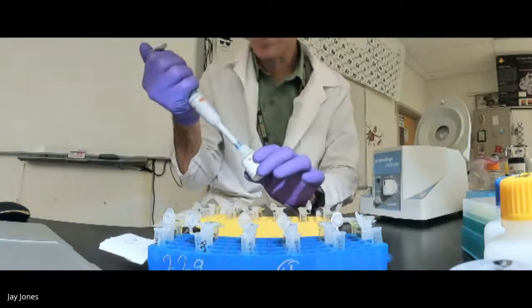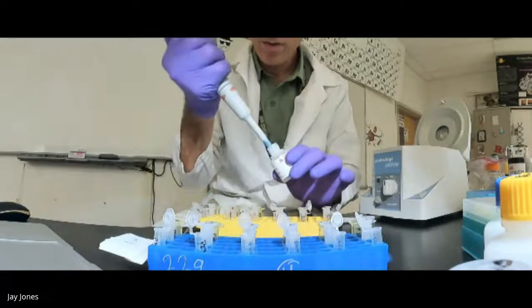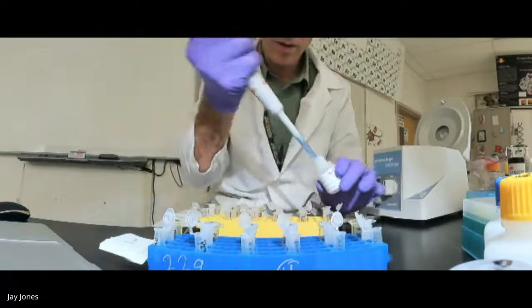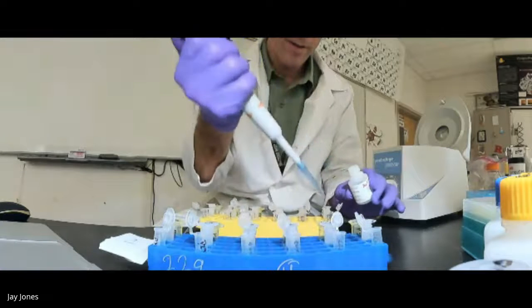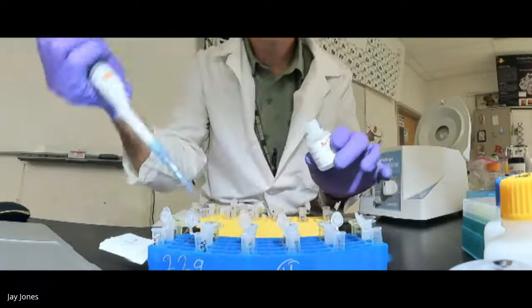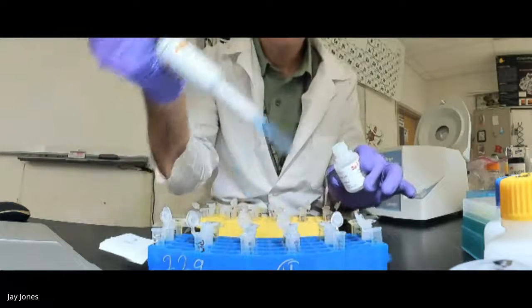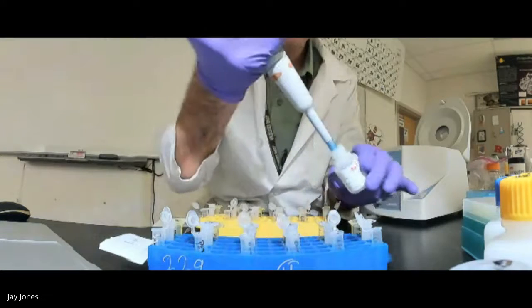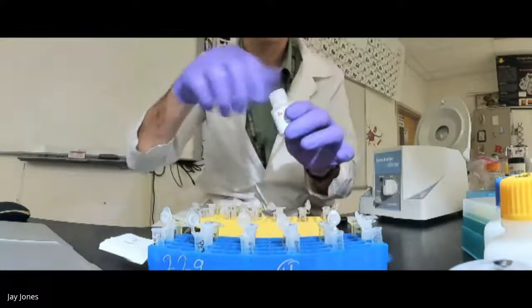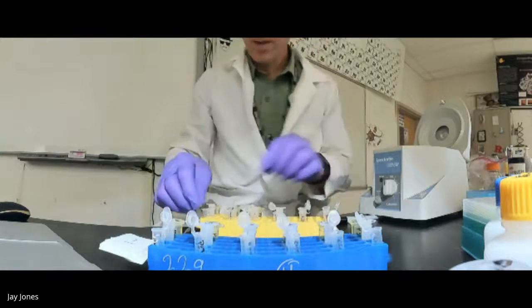I'll do period 12 first because it's closer to me. Solution two. Table two. Table three. Table four. Table five. Table six. Here's period three. Table one. Table two. Table three. Table four. Table five, and table six. Now I was really careful to make sure that I saw that solution two went into every microfuge tube. I'm going to close these up.